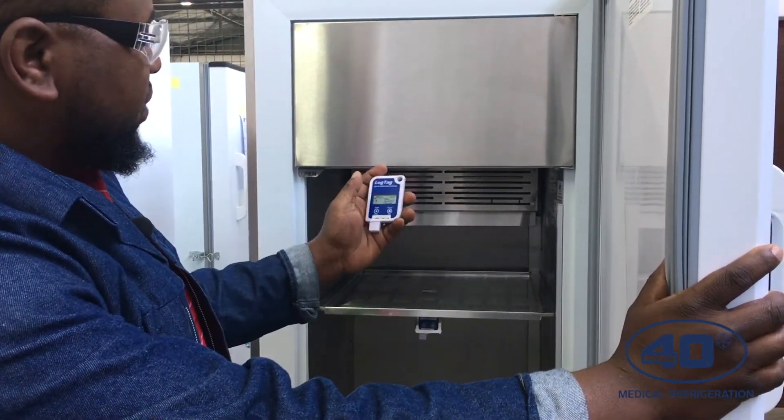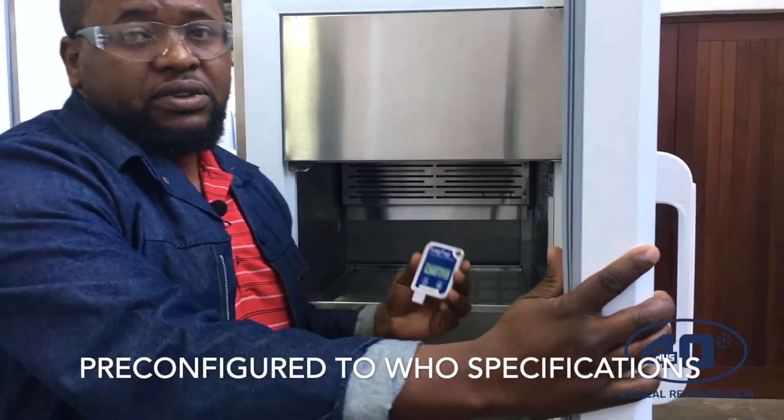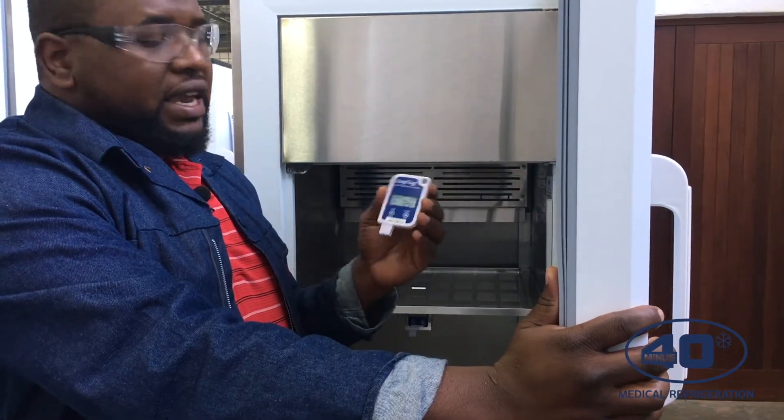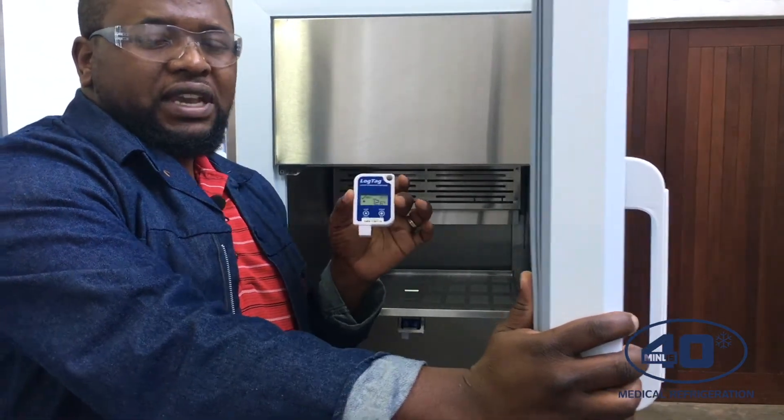The U316 is pre-configured according to WHO specifications. It records a reading every 10 minutes, and it has a storage capacity of three and a half months, after which it will override itself.